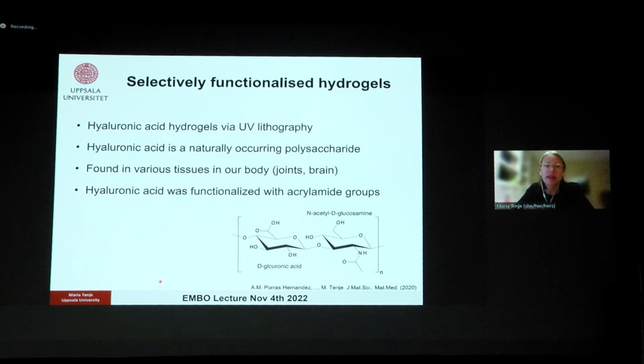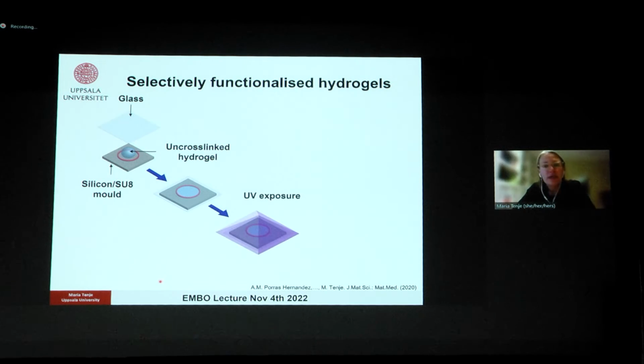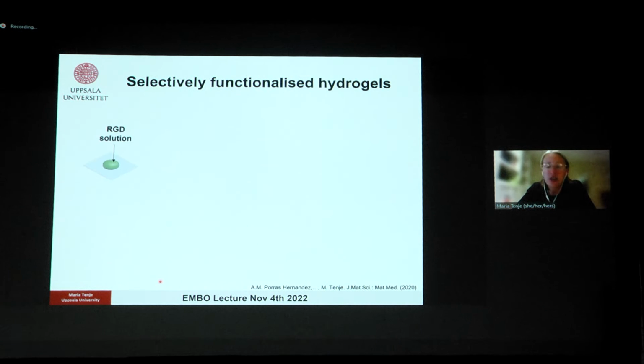Hyaluronic acid is found in various tissues in our bodies, the joints and the brain, and that's why we have chosen to work with this material. We started by functionalizing with acrylamide groups onto the backbone, and then we could place a small amount of hydrogel in a mold, press down a glass lid so that we define the height, expose it to UV light, and then have a cross-linked hydrogel. On top of this cross-linked hydrogel, we then placed RGD solution, which is a peptide to support cell adhesion.